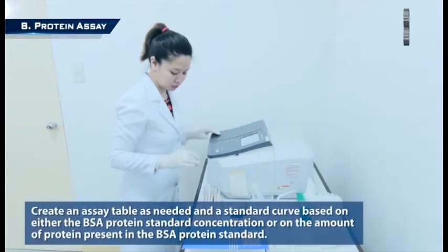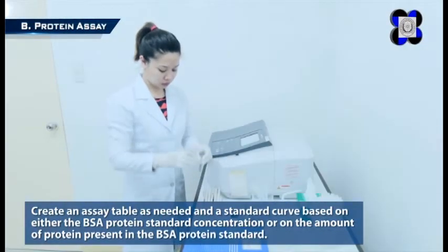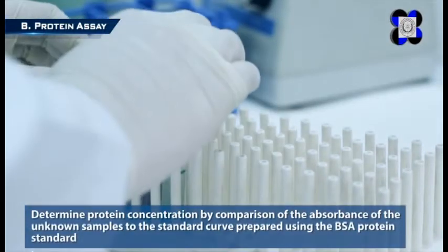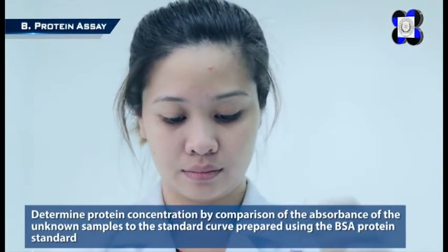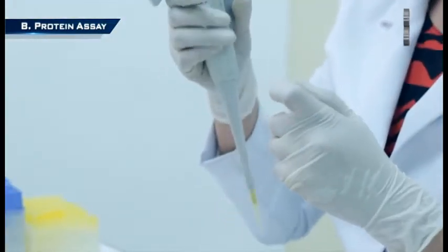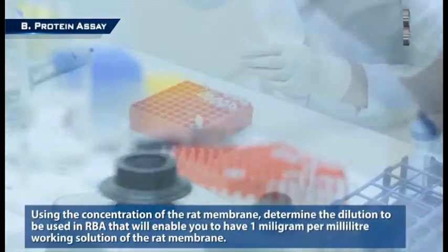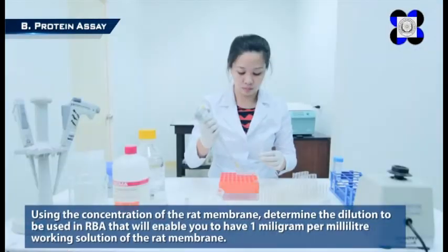Step 8: Create an assay table as needed and a standard curve based on either the BSA protein standard concentration or the amount of protein present in the BSA protein standard. Determine protein concentration by comparison of the unknown samples to the standard curve. Using the concentration of the rat membrane, determine the dilution to be used in RBA that will enable you to have a 1 milligram per milliliter working solution of the rat membrane.